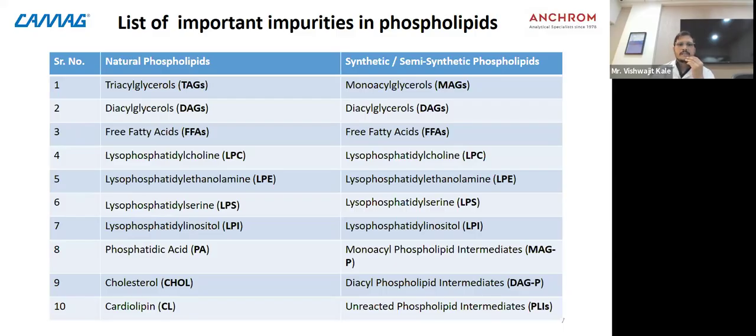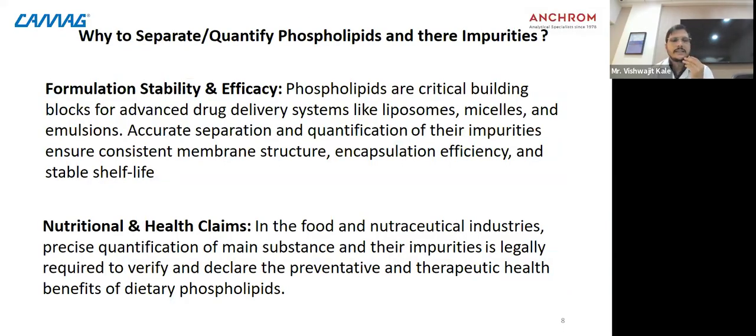In natural phospholipids there is, for example, lysophosphatidylcholine, which is common in synthetic phospholipids also. So there are many methods available right now. Out of those, we have selected three methods.